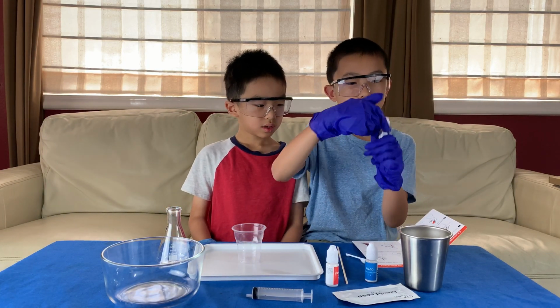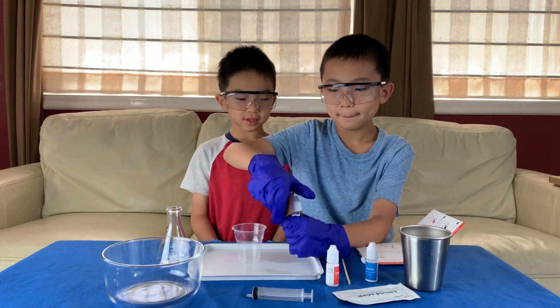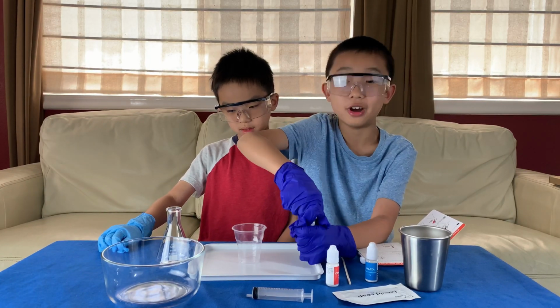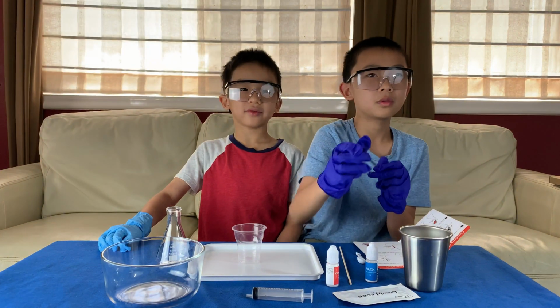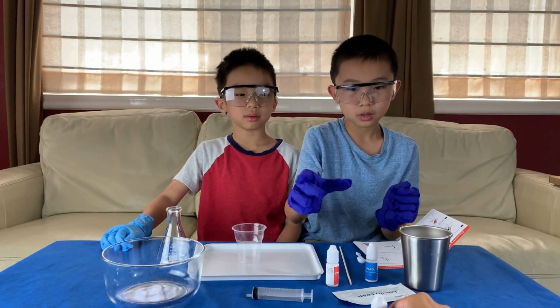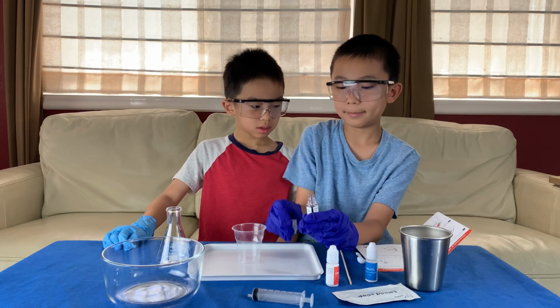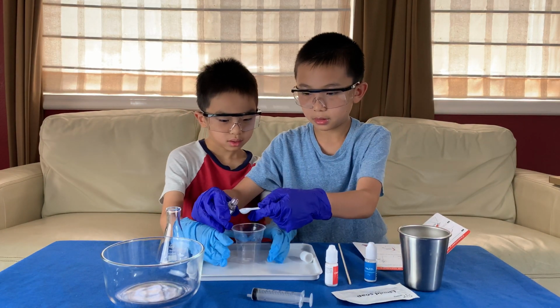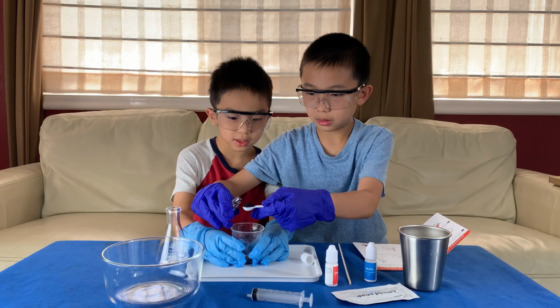This has 3 grams. Okay, so I'm going to open it. Careful, don't drop it. If we do drop this one, it will be bad, but not horrible because it's not dangerous. But I'm still trying not to drop it, of course. It's one of those that you have to push down and then turn. Okay, with the food colorant, I'm going to pour it in. Oh, wait, no. I need to use the big spoon. Oops, that's a bit too much.